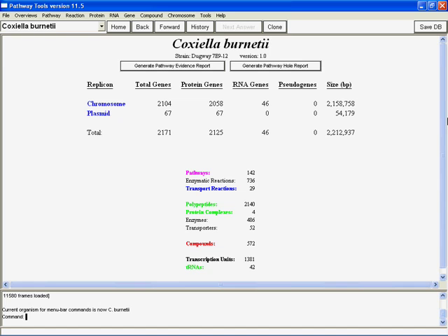So with that in mind, we're going to want to take a look at what's actually inside a reaction frame. And remember, this is a frame-based database, so functionally the same thing as a page, but the frame is where the information is stored. So let's go find ourselves a reaction.